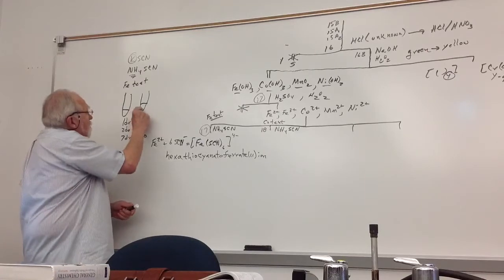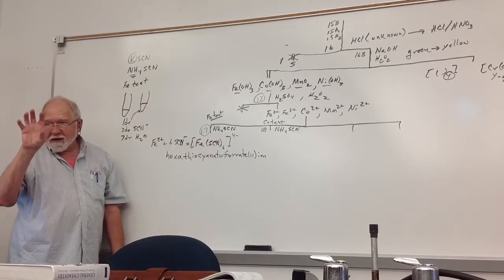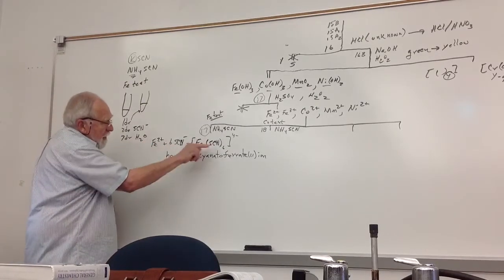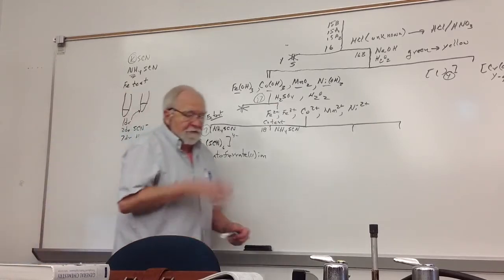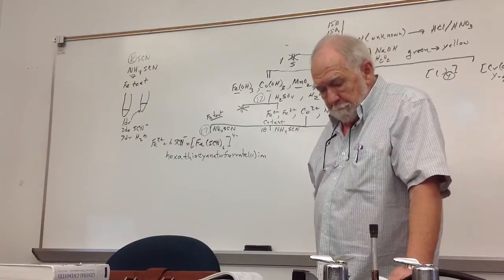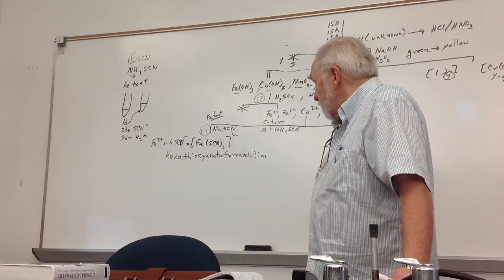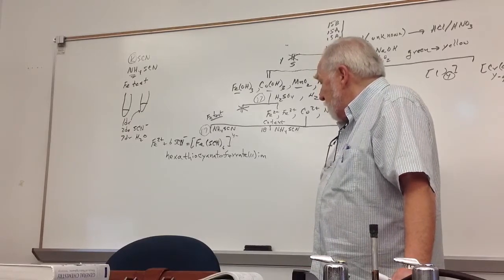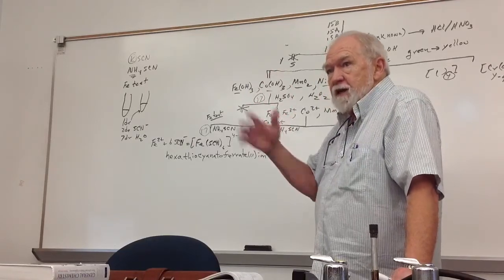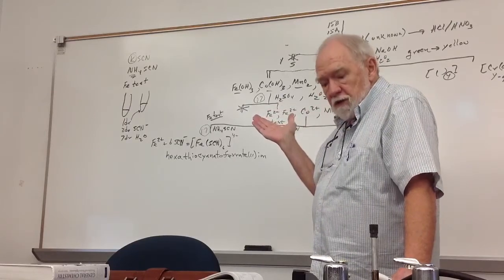And sometimes if you don't see a really dark color, you can add another drop of thiocyanate because the factor between 11 drops and 10 drops is not significant. And not having enough thiocyanate, shifting it all the way to the fully complex ion could be a problem. Okay? And this will make it lighter. And remember when I was talking about the formation of the complex going in a series of steps. The 4 is the one your book put down, but if you add enough extra thiocyanate, it goes to the hexa.